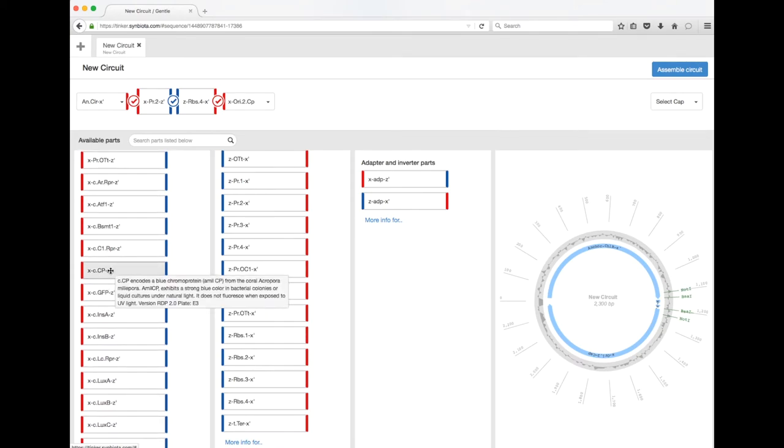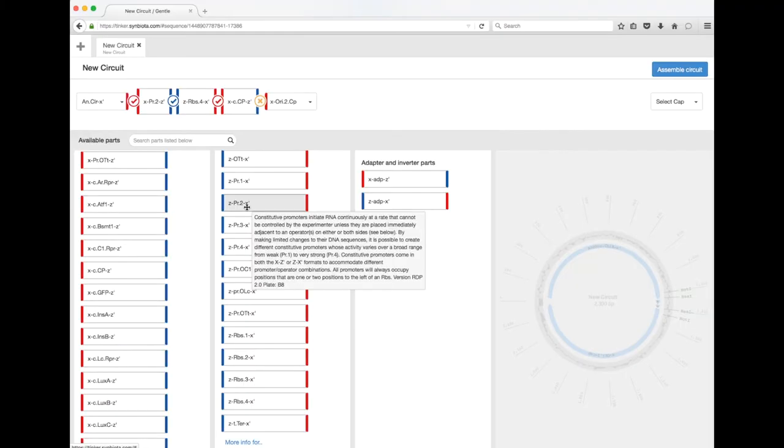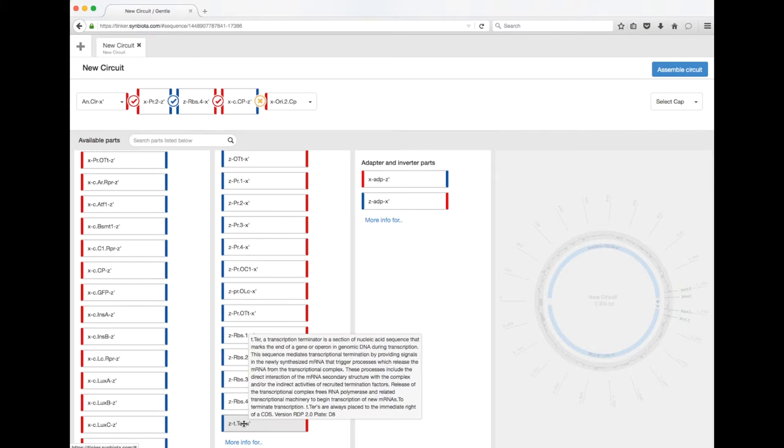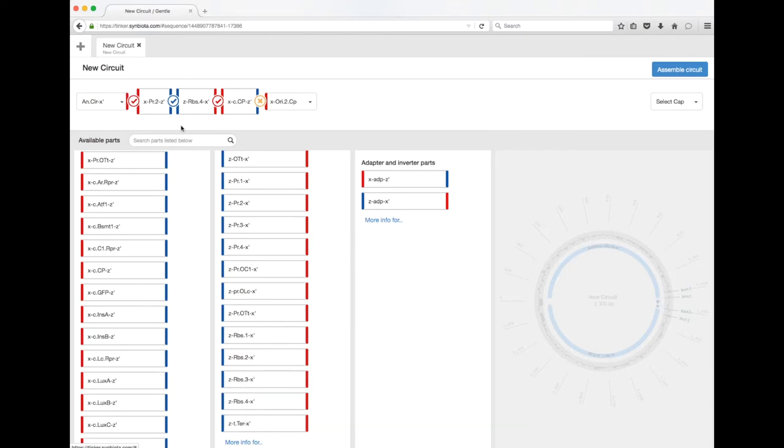We're going to go with the simplest option — I recommend you start with this — just make some blue bacteria. So you've got a promoter, you've got the ribosomal binding site which will cause translation of what's next to it into protein. One of the last things you can add, which always helps, is called a terminator. A terminator is a short piece of DNA that tells the cell to stop transcribing the DNA into RNA and helps boot the RNA polymerase off the DNA.